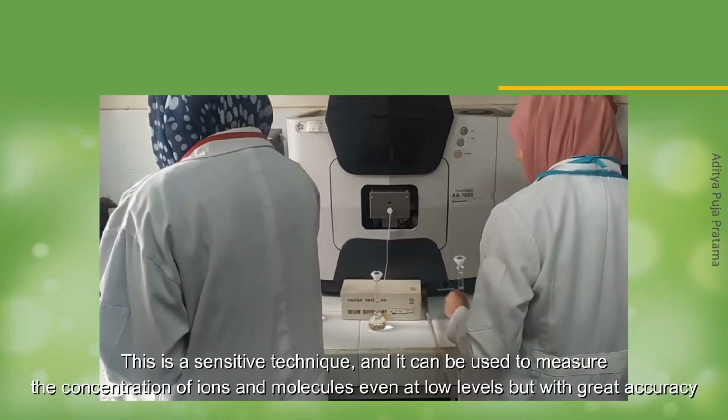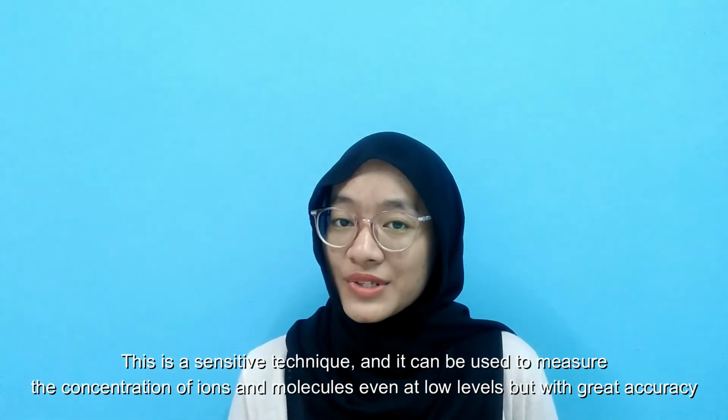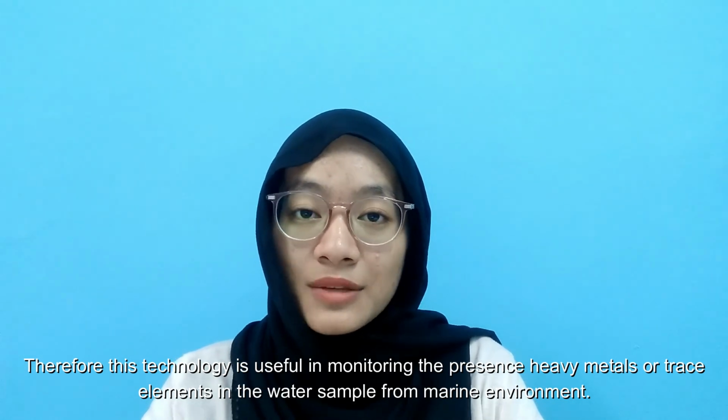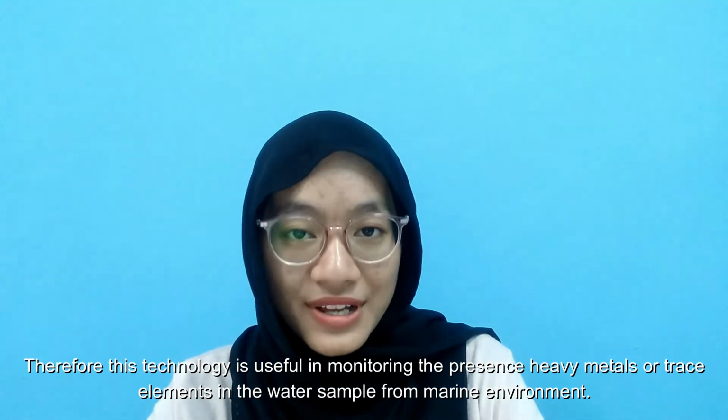This is a sensitive technique, and it can be used to measure the concentrations of ions and molecules, even at low levels but with great accuracy. Therefore, this technology is useful in monitoring the presence of heavy metals and trace elements in water samples from marine environments.